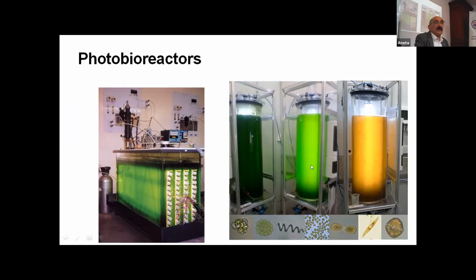You can see the light is in the middle in a glass cylinder here, and you have the lights here where we have this photobioreactor with the flat surface and with two different rows of lights inside. So you have a thin tank filled with water and algae, so light can very easily penetrate through this.